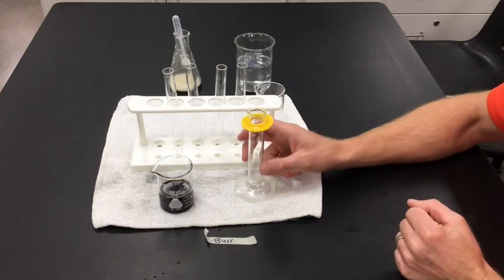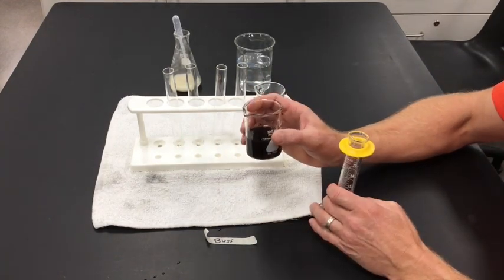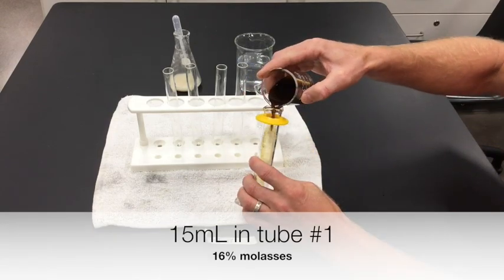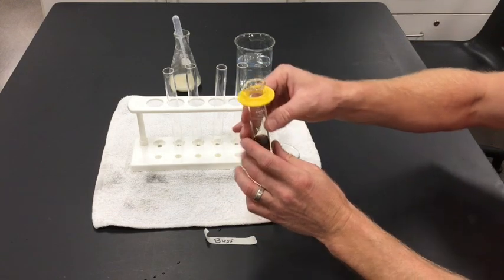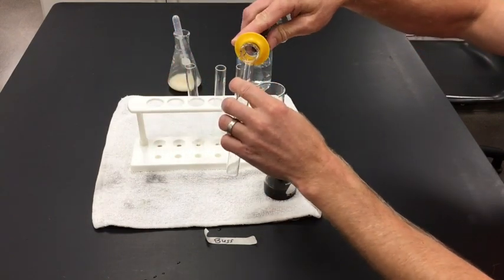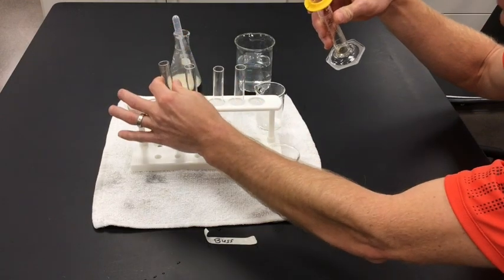We're going to start by taking 15 milliliters of the solution that the teacher provides. Measure that in your graduated cylinder, take a reading, and add that to a test tube — that's the easiest one to do.